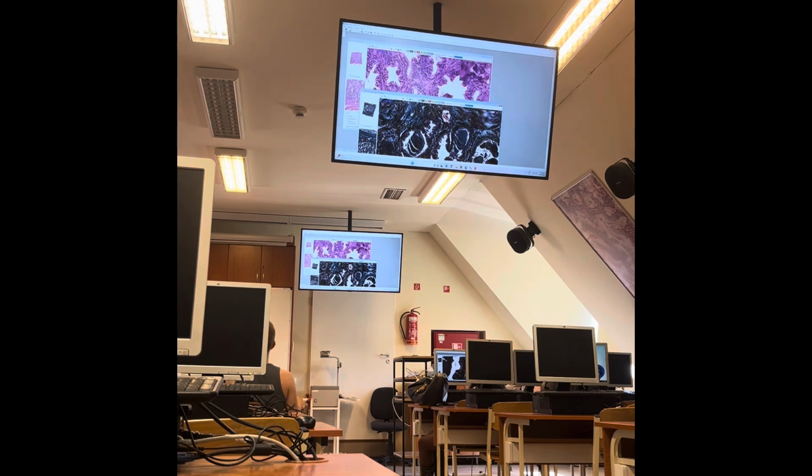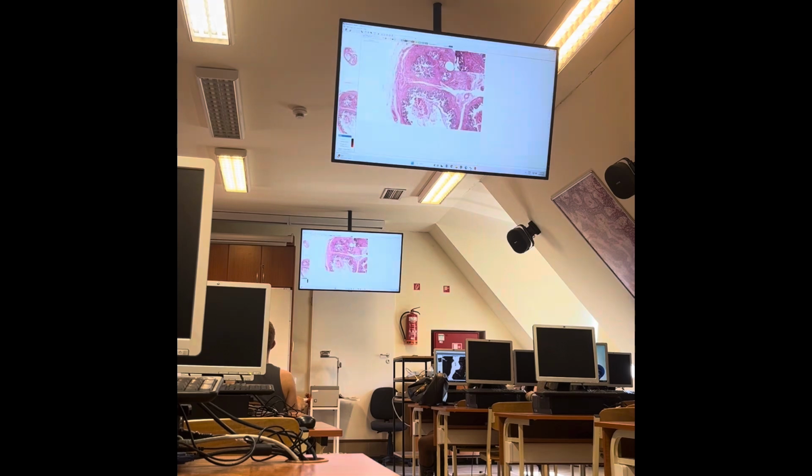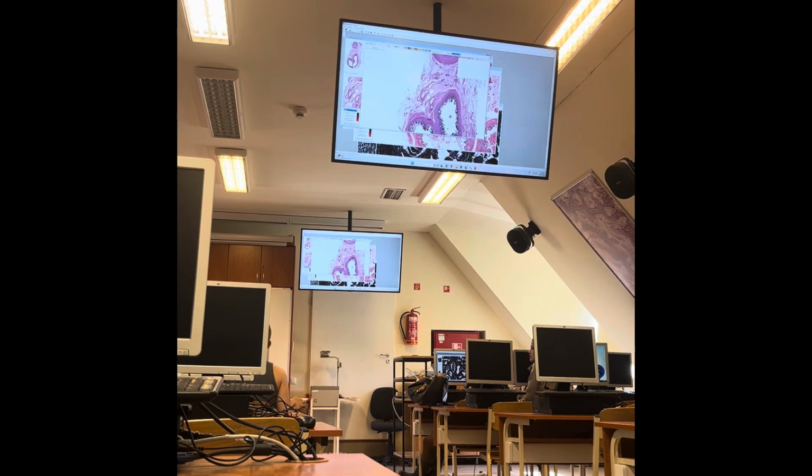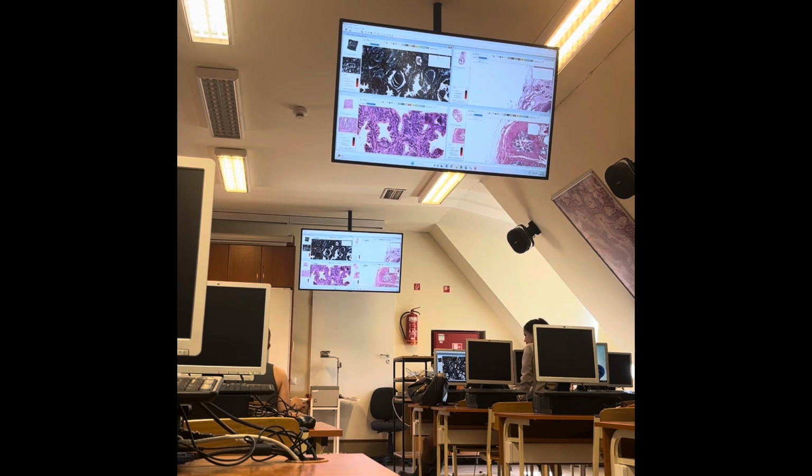Then I give you now some time to look at the specimen and ask your questions, and then I will show the specimen on the screen.